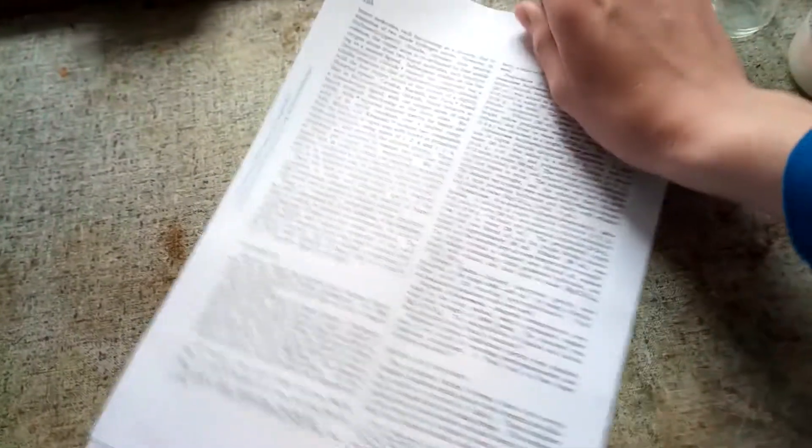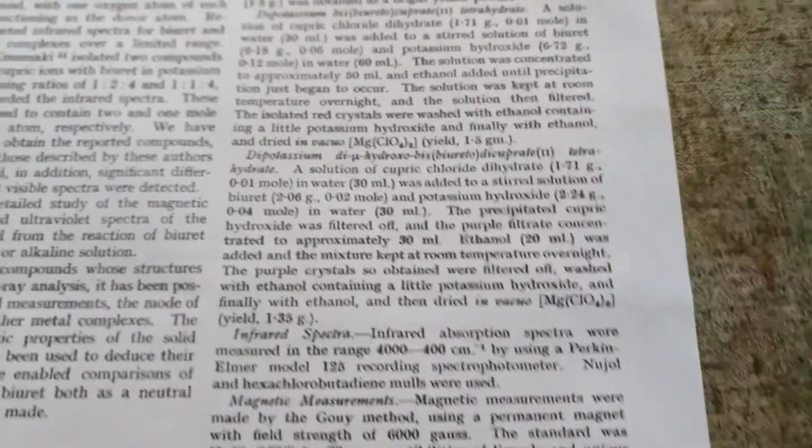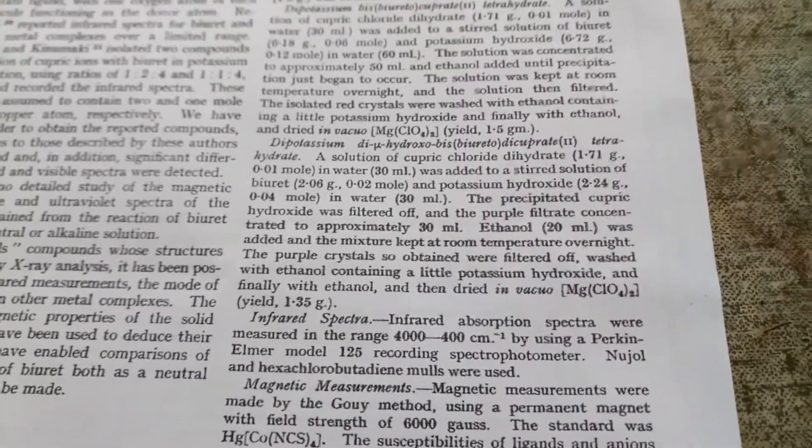There are some procedures in here — that's the one for the copper. They use potassium hydroxide, but I'm going to substitute that for sodium hydroxide. I'm also not sure whether to use ethanol or just water. I'm going to scale that procedure up by a factor of two, and use copper sulfate instead of copper chloride because I don't have any copper chloride.